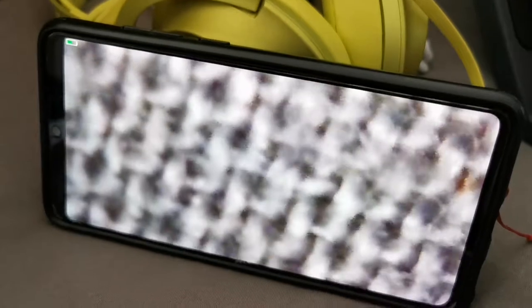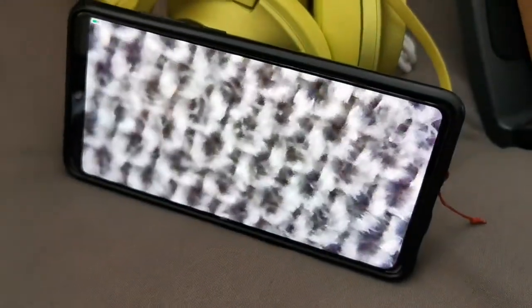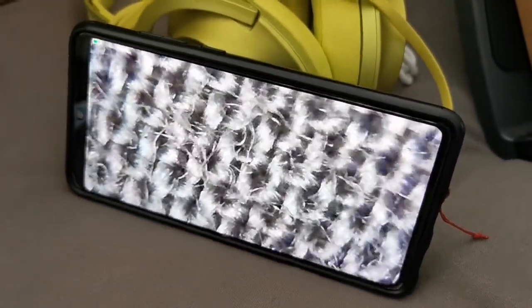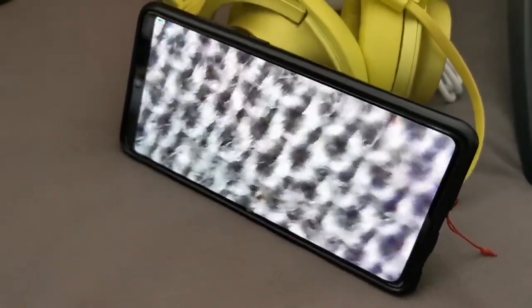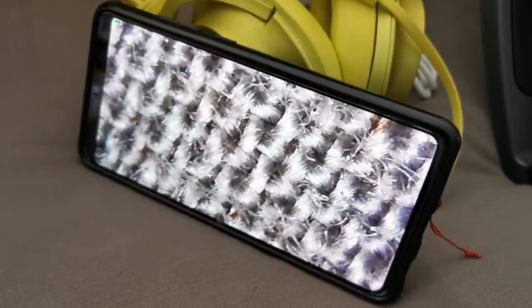Dinda is trying to magnify the bed sheet and look at the fiber — it's so vivid! She's trying to fix the lens. It could magnify the tiniest details of this bed sheet. Is there any living bacteria in our bed sheet? We didn't see anything, but there is a little bit.